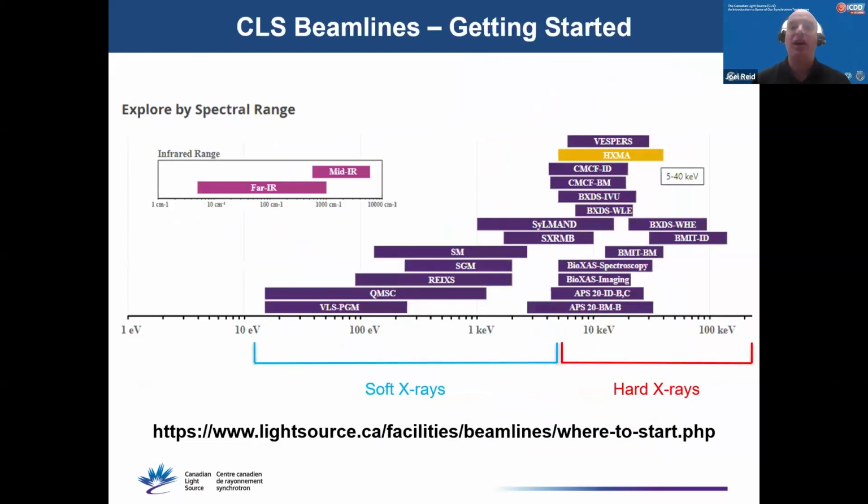If you want to better familiarize with our beamlines and techniques, we have resources on the web that illustrate the energy ranges of our beamlines. And each of these individual beamline bars leads to a web page describing the specifications and techniques that are available for each beamline. And there's also a solutions email on this page. So if you've got a specific project in mind, but need advice on how to get started, you can email us and your questions will get directed to someone who's appropriate to answer them.